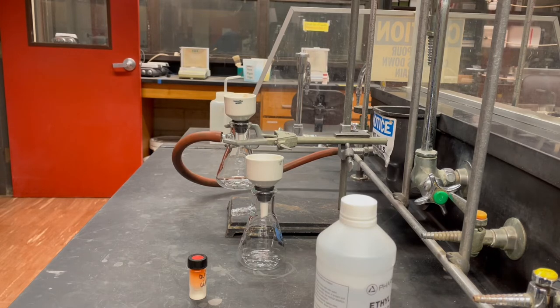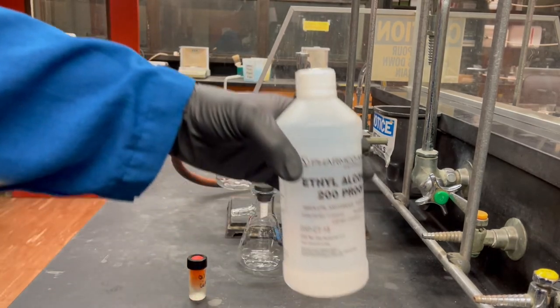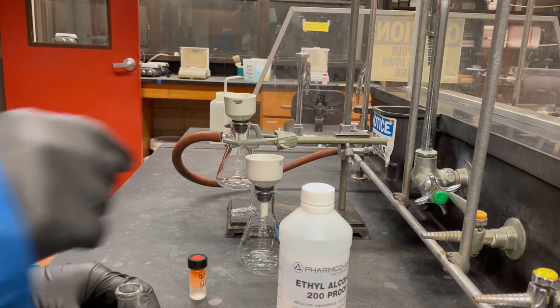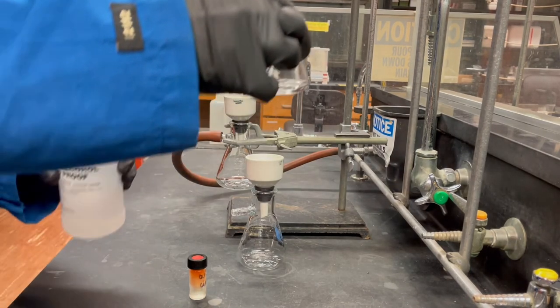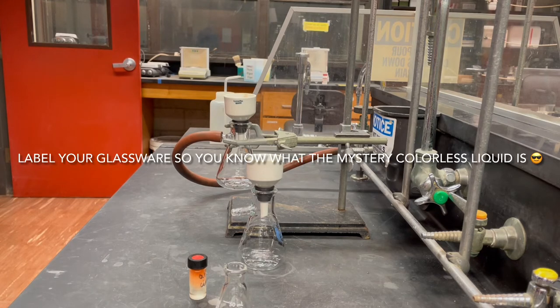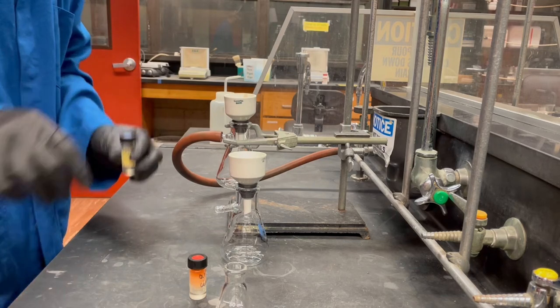Now what I'm going to do is filter this stuff, and then wash with a little bit of cold ethanol. I put this guy in the freezer, and I guess I'll narrate what I'm doing as I'm doing it. Putting a little bit of ethanol here, so that I don't contaminate the bulk material. I have two filter flasks for the two different reactions.